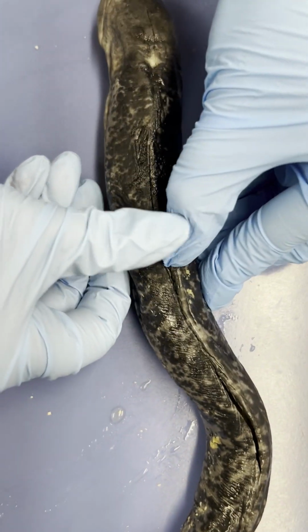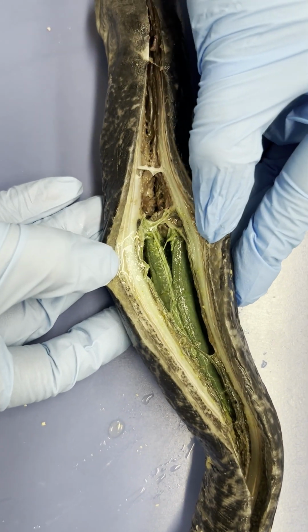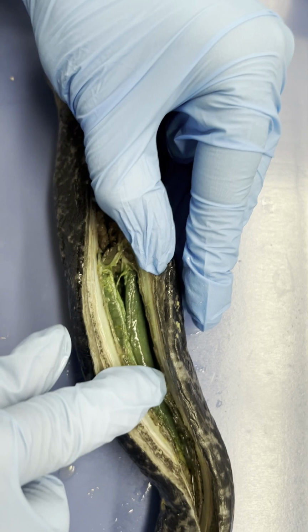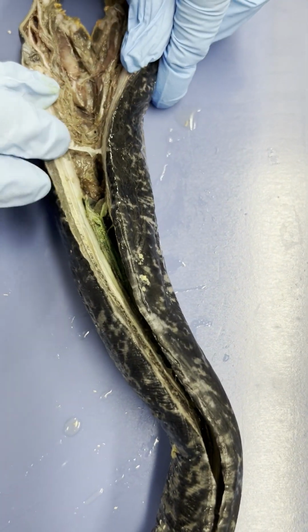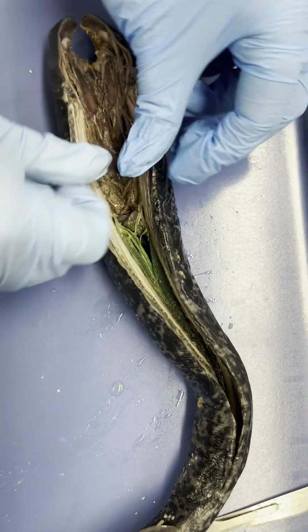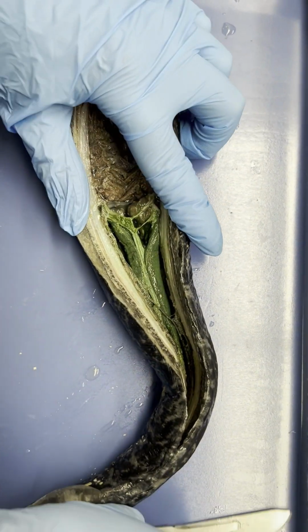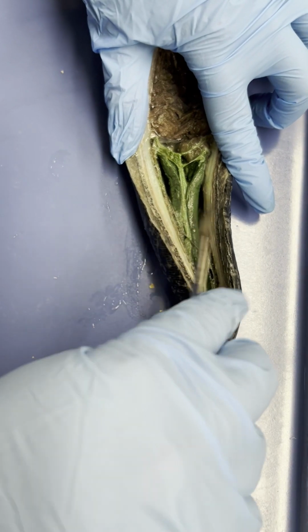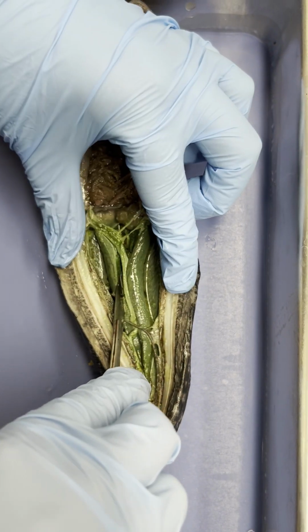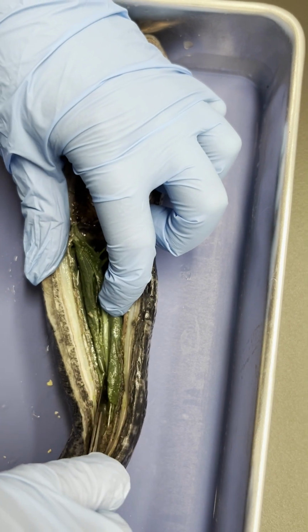So we're gonna open this guy up, and I would say it looks like we have a pretty good cut here, although not all the way through in this region. So we're just gonna make that a little bit more exact. So I'm gonna first push down on either side so we can maximize the cut that we did get. And then we will just kind of cut along our line here too. Cut that as best we can.